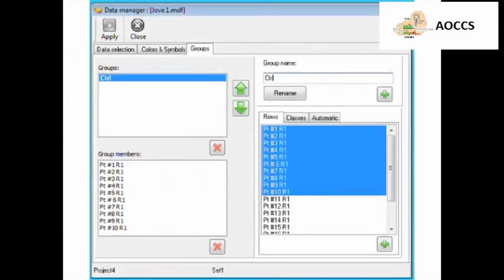Load the final MDF file into GenX, and open the Data Manager to classify, cluster, and visualize microRNAs and samples on heatmaps and dendrograms. Then, select and create groups of samples, and click Apply when you're done.